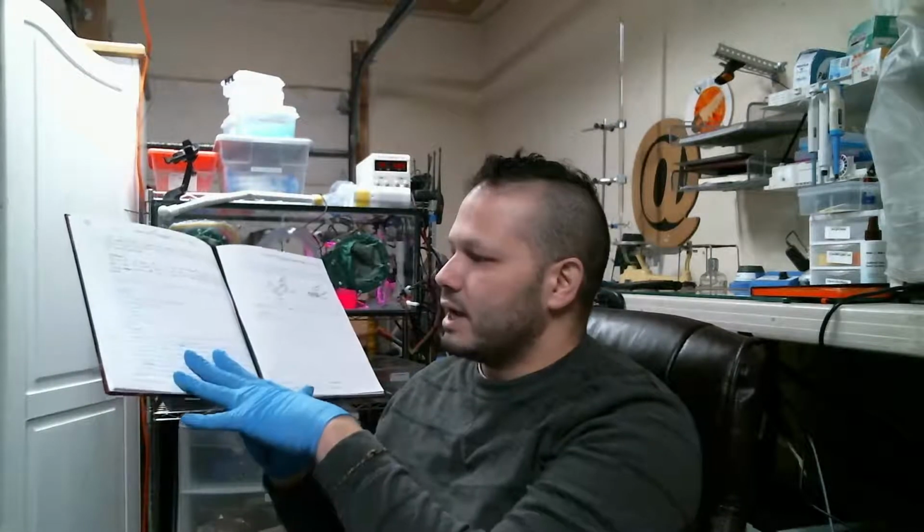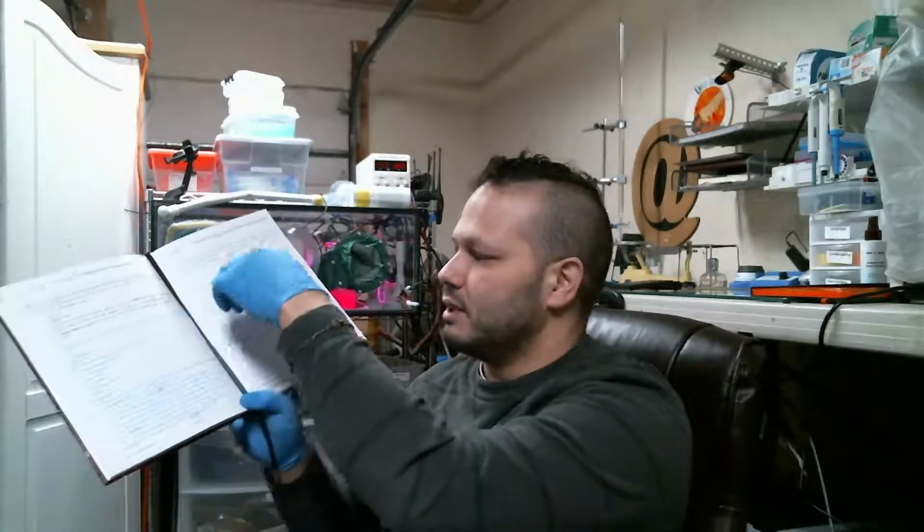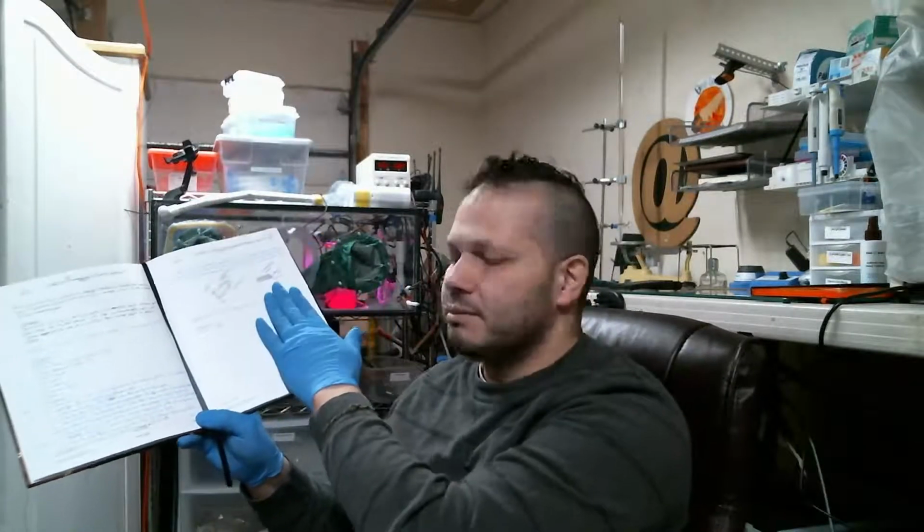And then finally, in the supply list, if there are any chemicals that I ordered out, at the end of the protocol I'll have a list of all the reagents, all the chemicals, their name, their supplier, their item number, and then the last thing I'll do is make a reference list.